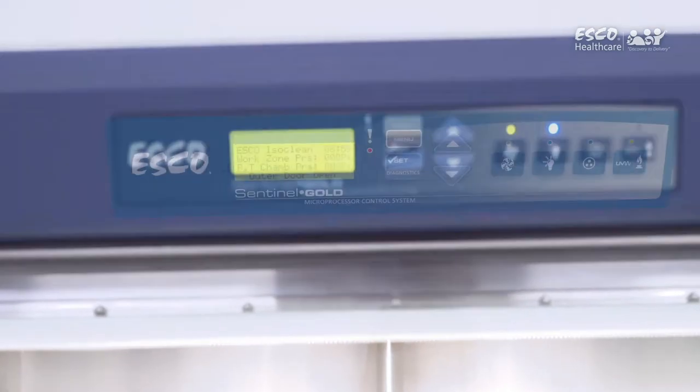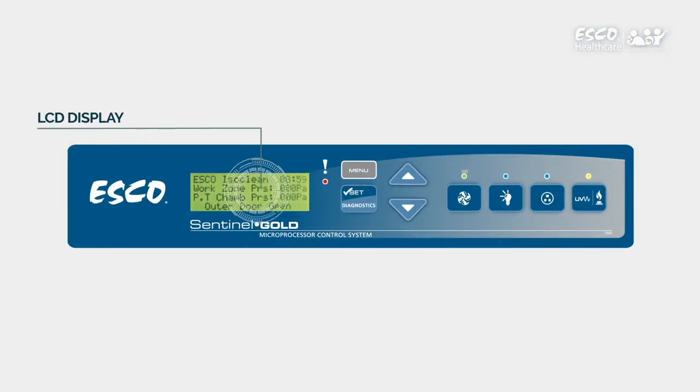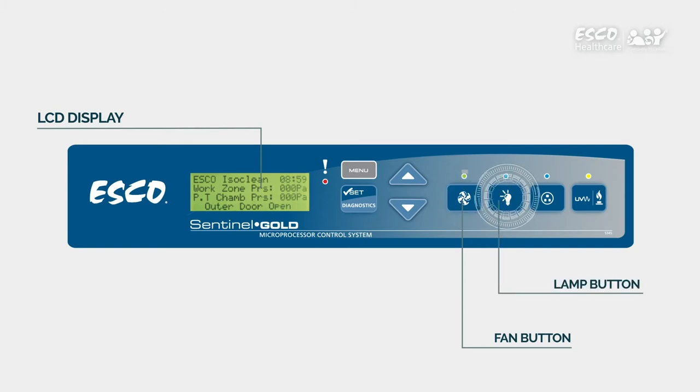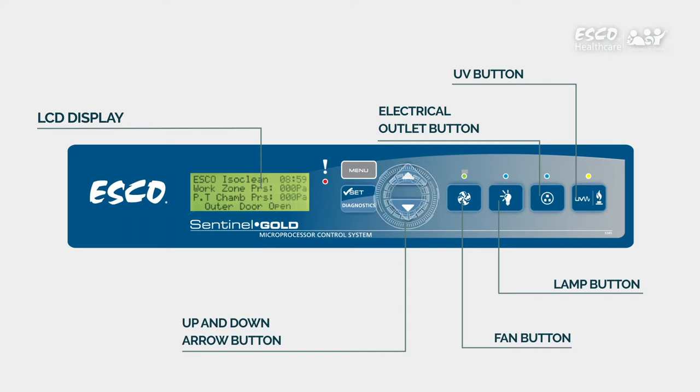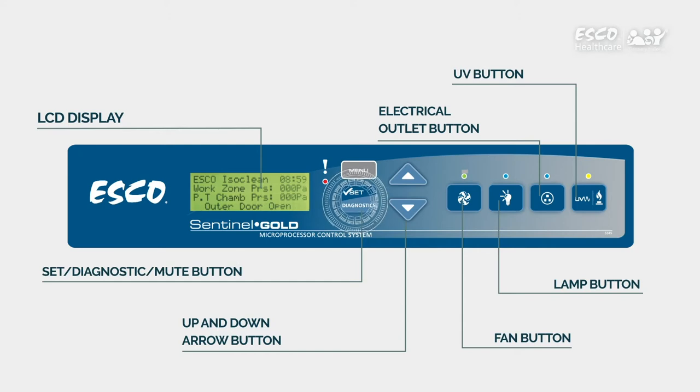The Sentinel Gold System has the following parts: LCD display, which provides the status of the unit; Fan Button, for turning on and off the fan blower system; Lamp Button, which turns on and turns off the lamp; Electrical Outlet Button, for turning on and off the electrical outlet if present; UV Button, for turning on and off the UV lamp when available; Up and down arrow buttons, for moving the menu options upwards and downwards; Set diagnostic mute button, for proceeding to the next step, level, or sequence in the menu options, for entering the diagnostic mode, or for muting the alarm; and Menu button, for entering and exiting the menu options.